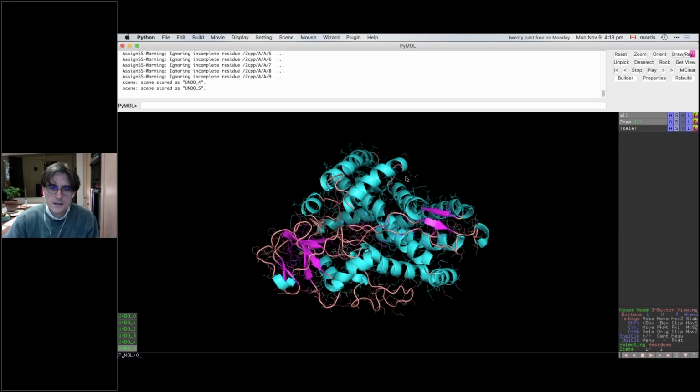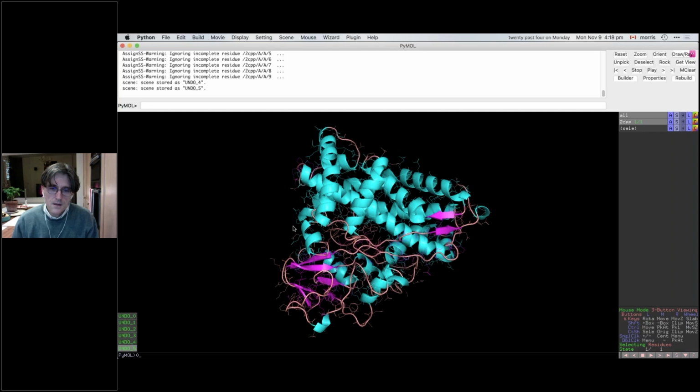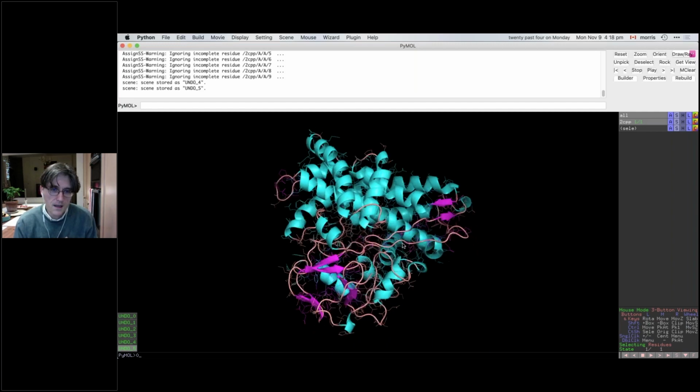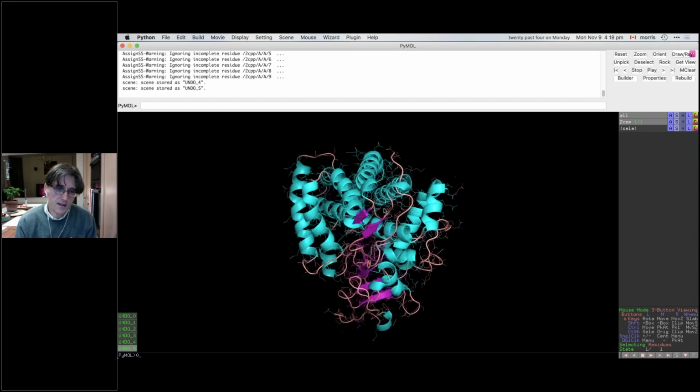Okay, so I guess I should show more about the mouse first. I've been just clicking on the left mouse button and dragging, and what you need to do is think of, if you like, a circle around the object, around the center of the viewport, and in that circle is a sphere, a ball, actually a virtual trackball. If you click anywhere on that virtual trackball, it's as if you're spinning the object using that.